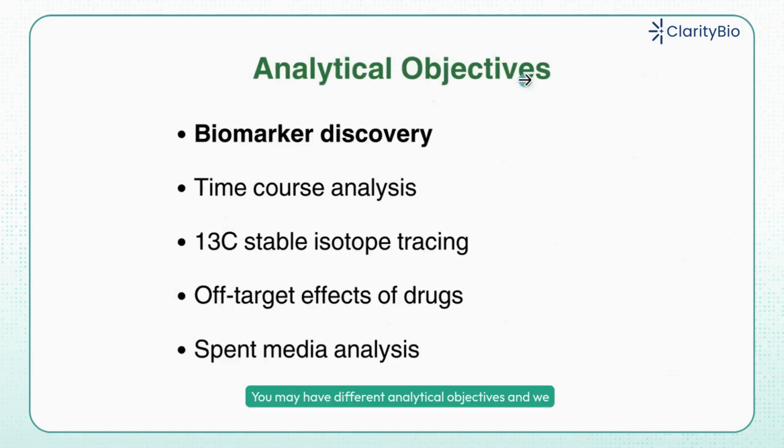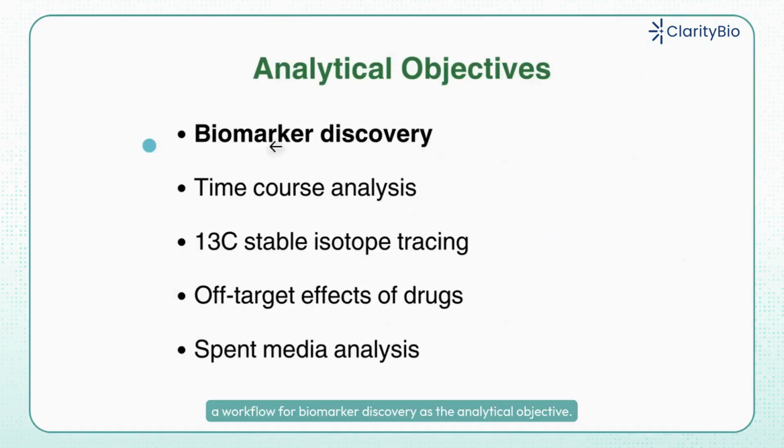You may have different analytical objectives, and a workflow for biomarker discovery as the analytical objective. But there could be other objectives, and a lot of the analysis pipeline remains the same. There are some minor changes that may take place toward the end of the analysis pipeline, depending on what the objective is.